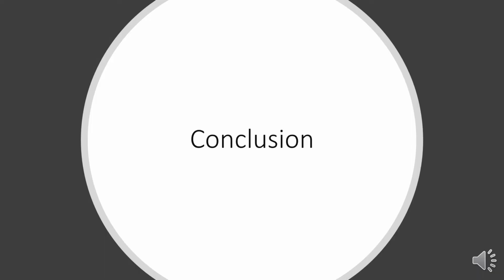Conclusion. Centrifuges are available and often necessary pieces of laboratory equipment. Knowing what a centrifuge machine is and the forces at work is important to get the best use out of this tool.